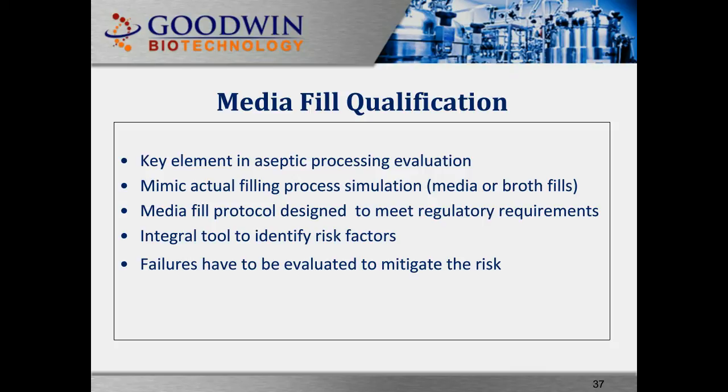A key element in aseptic processing evaluation is to mimic the actual filling process by simulation using media or broth fills. The media fill protocol should be designed to meet regulatory requirements and is an integral tool to identify risk factors, and failures have to be evaluated to mitigate the risk.